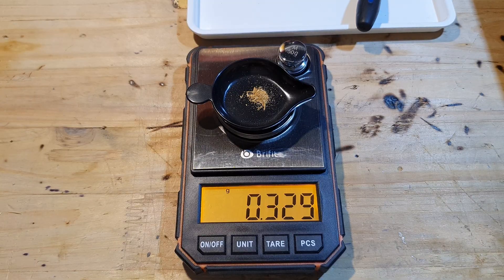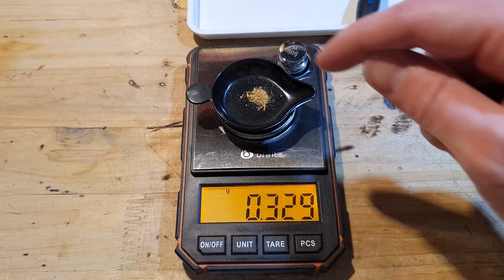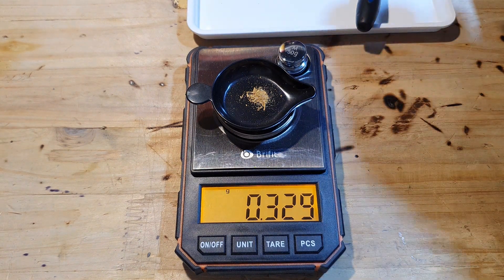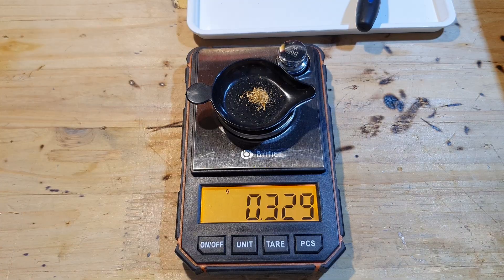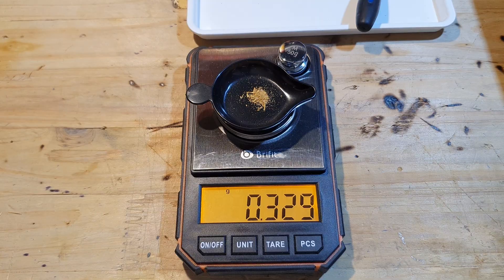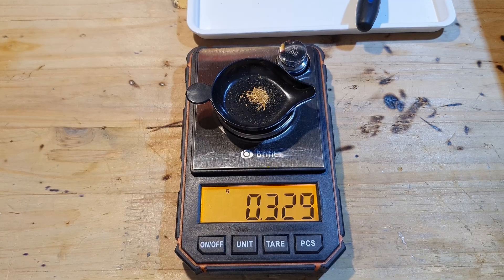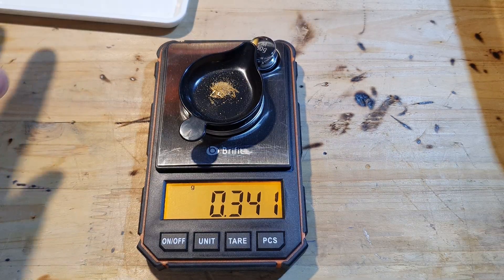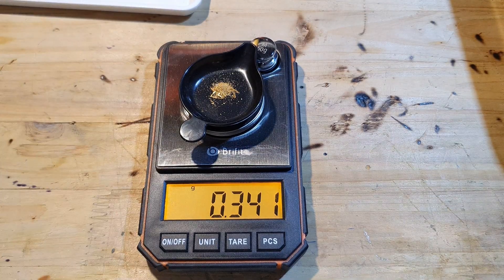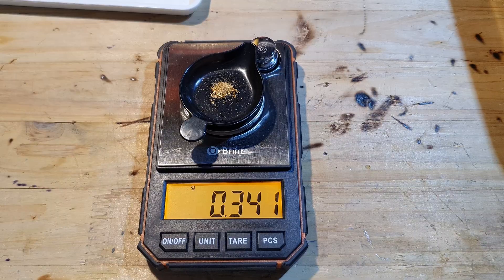I think I will leave it at that and try it with 0.33 grams of gold. As you can see there are some larger pieces in there. The problem is that gold is so soft that when filing it, the edges roll over and at some point detach, giving larger pieces. We will see if they react or if it really needs to be a fine dust. I collected the rest of the gold and we are now at 0.341 grams, and I will try it with this amount.